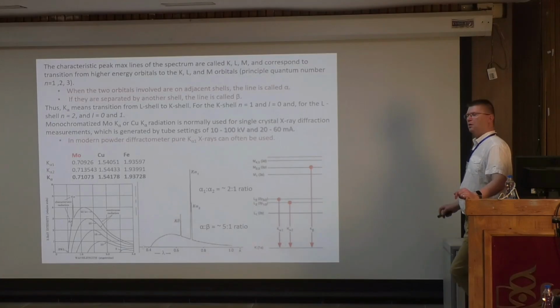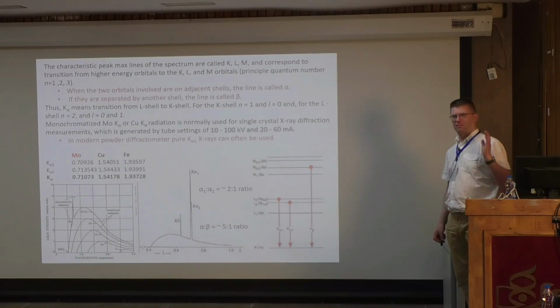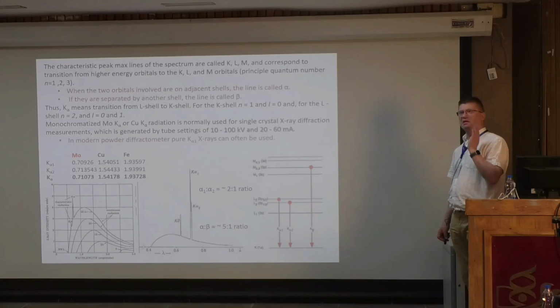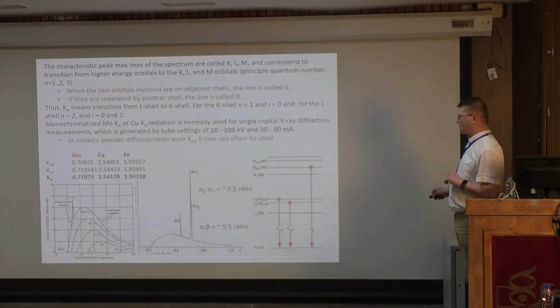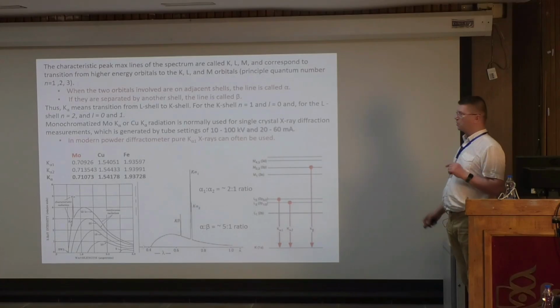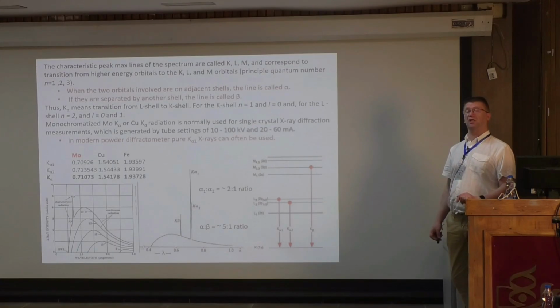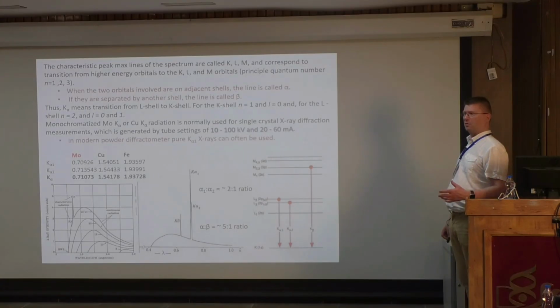The point in there is we cannot use the whole spectrum, because remember, Bragg's law indicated the wavelength. And the wavelength was one number. So we cannot use a continuous wavelength in there because we would get a blur. So what we have to use is either one of them. So either this K alpha wavelength, or this one. So this is nice because we can easily measure them. We know what is the wavelength for this.